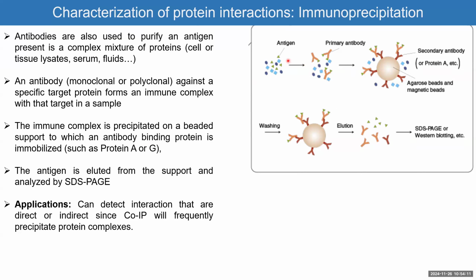So we can imagine that this triangle binds to probably one of these proteins in blue. So all I have to do is to bring an antibody that is specific to that triangle and pull that down. In order to pull it down, I have to use something called agarose beads or magnetic beads, which allow those antibodies to bind. Yes, there was a question here.